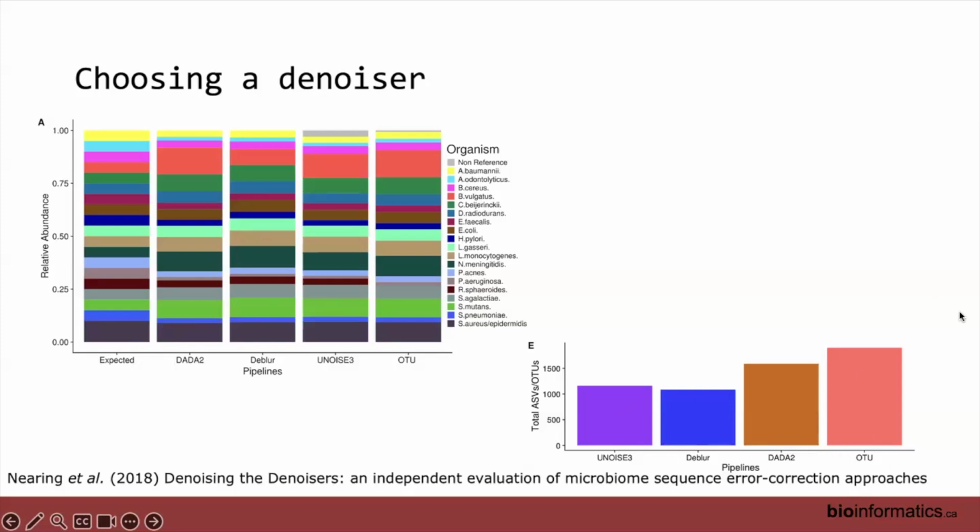As I was saying, you often get a lot more OTUs than you would expect based on what is in there, especially as these come from, I think, probably 20 different taxa in the original sample. So you can see how these really will inflate any differences in diversity that you might be looking at.